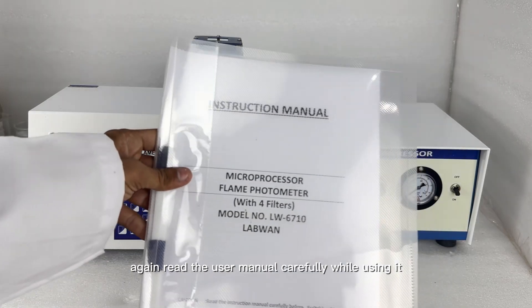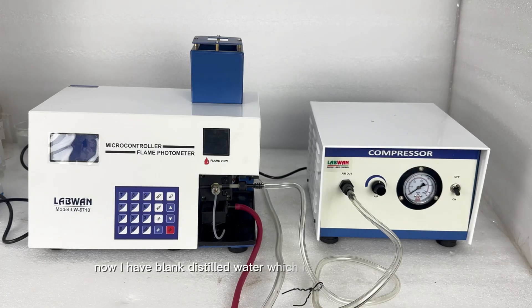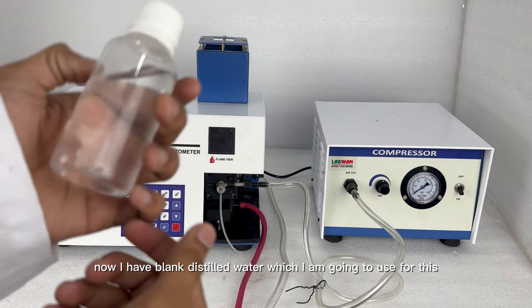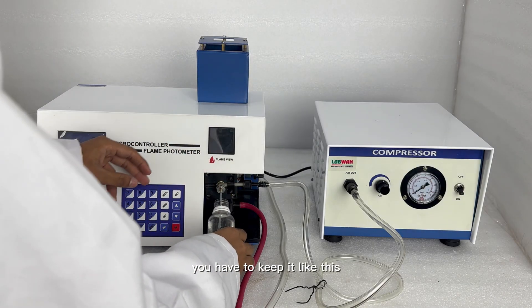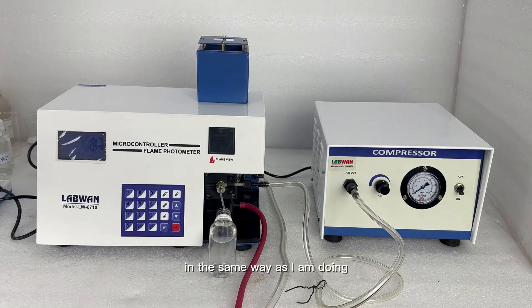Again, read the user manual carefully while using it. Now I have blank distilled water which I am going to use. You have to keep all the solutions and the blank in the same way as I am doing.